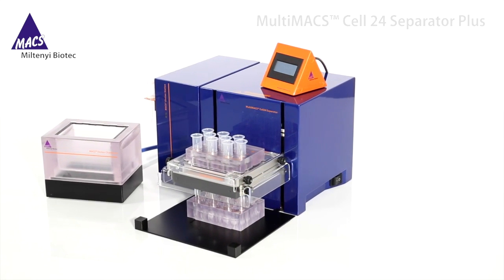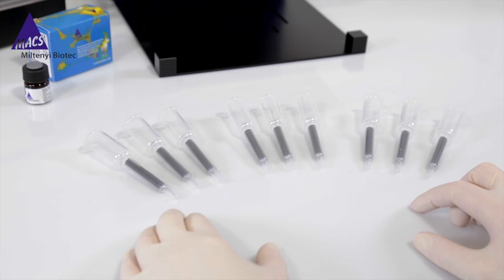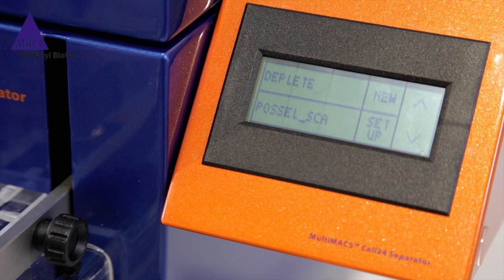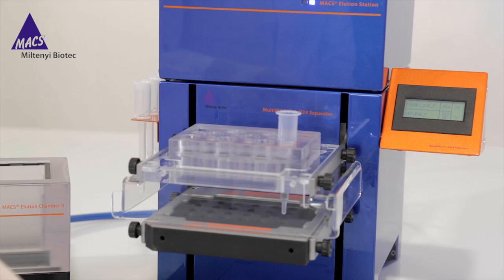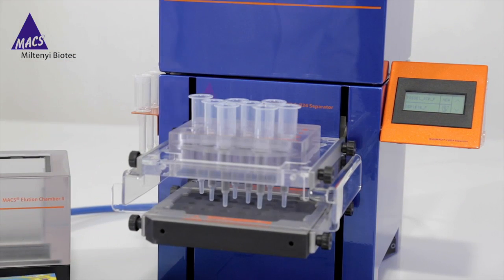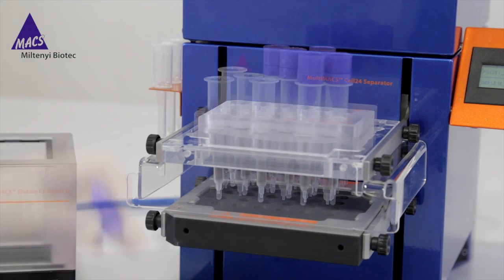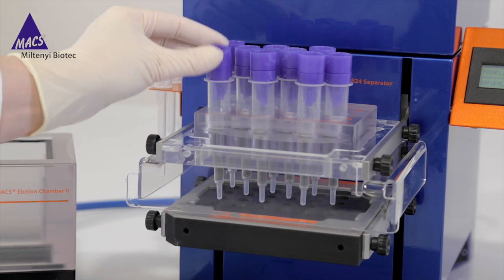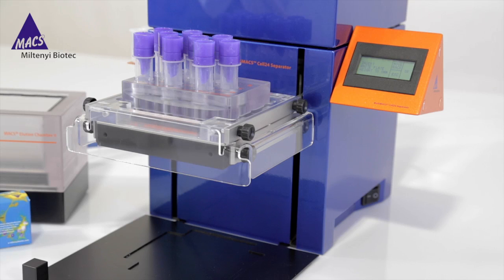Here we use 3 LS columns per adult brain, so in this case 9 LS columns in the single column adapter. If you had more than 9 samples, the Multi24 column block is available. Switch on the device. For removal of myelin debris, we use the Deplete program. When 'Insert Columns' appears, insert the single column. Alternatively, for up to 24 samples, use the Multi24 column block. Place one pre-separation filter on each LS column. Put the adapter and the LS columns into the MultiMACS column holder. Press OK. When 'Insert Waste Plate' appears, insert a 24-well deep well plate onto the TipTouch plate.